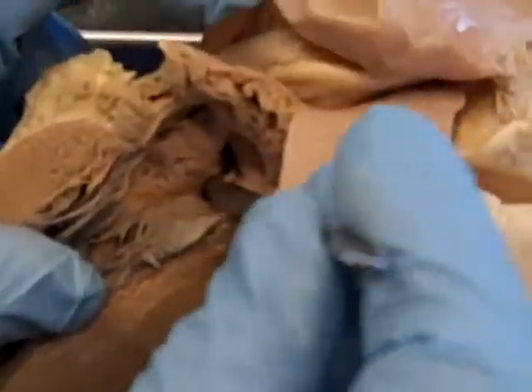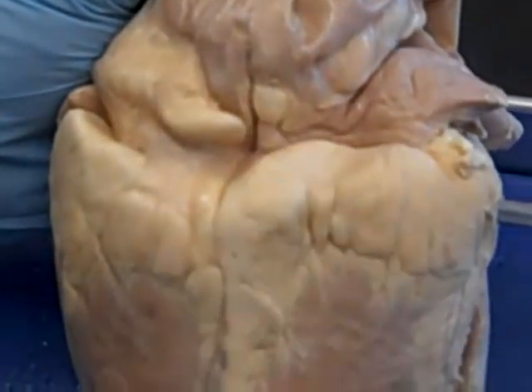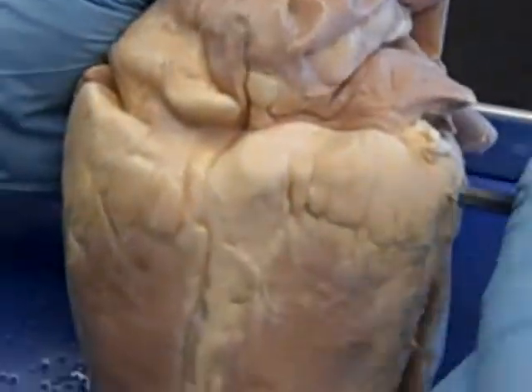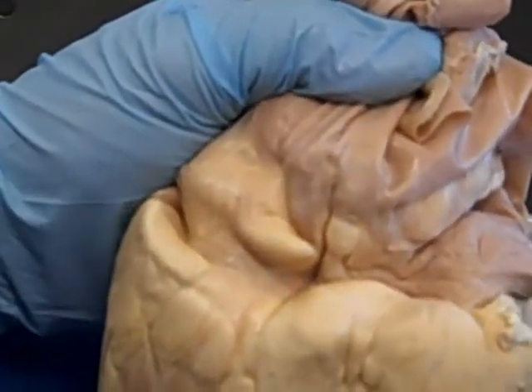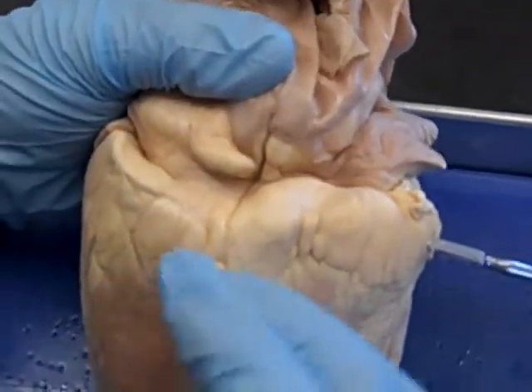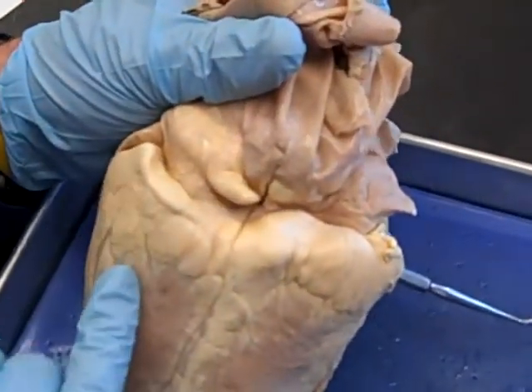Looking back into the right atrium, there's an opening where I've just inserted the probe — that is the coronary sinus. If we rotate to the dorsal side, you can see the interventricular sulcus running cranial to caudal. The coronary sinus is shaped like a Quonset hut — like half a tube — and it runs over the coronary sulcus, which separates the atria from the ventricles.